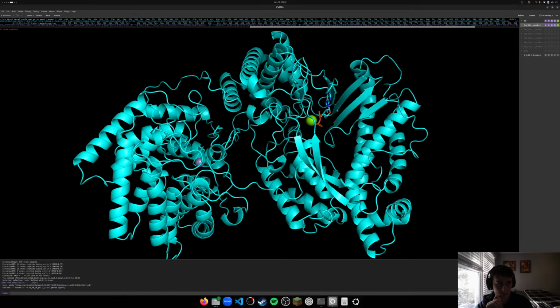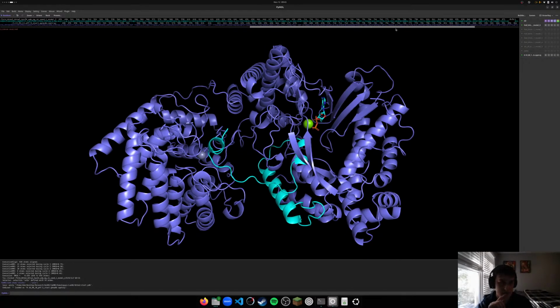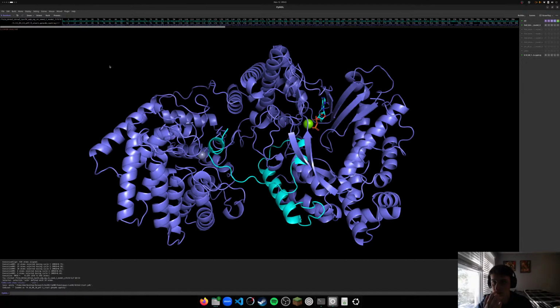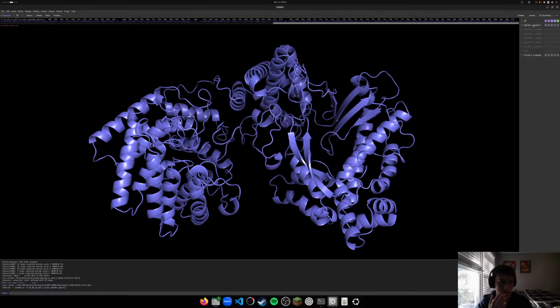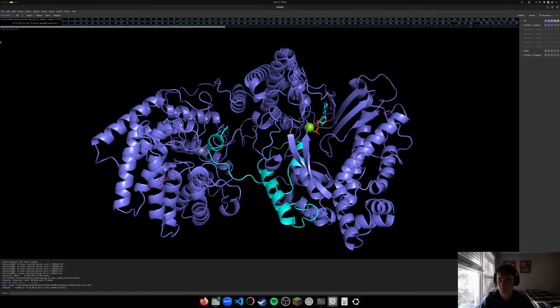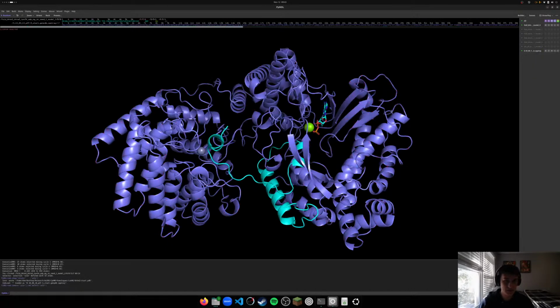Okay. So there's a couple of names that are changed, HIP, for instance, on some of them. So at this point, what we want to do is basically remove this. Action, remove atoms.